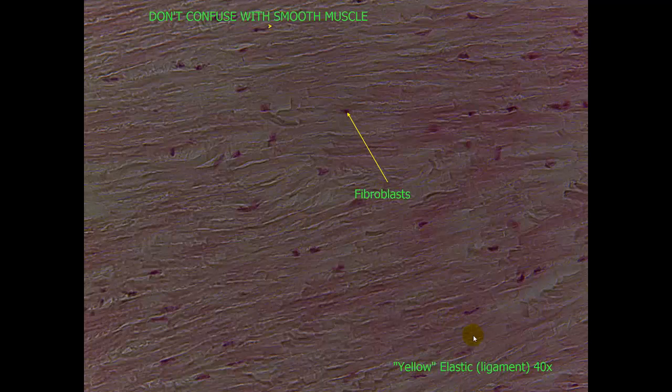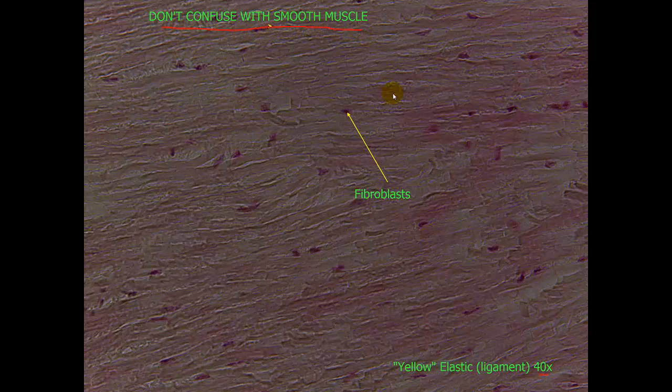Here is a yellow elastic ligament. And this yellow elastic ligament is a type of dense regular connective. This is at 10x. Let's take a closer look. Here it is at 40x. Don't confuse this with smooth muscle as well. I have seen that with students because they generally mix the two up. We can see the dark purple areas being the fibroblasts. These are the cells that are creating the fibers. And one thing to note, you can see it has somewhat of a fuzzy appearance or almost squiggly lines going back and forth. That is resulting from the elastic tissue itself. That is one thing that will help you distinguish this from something like a dense regular connective such as a tendon.